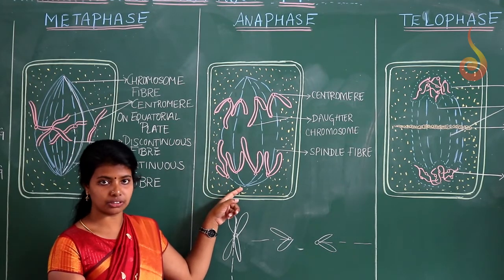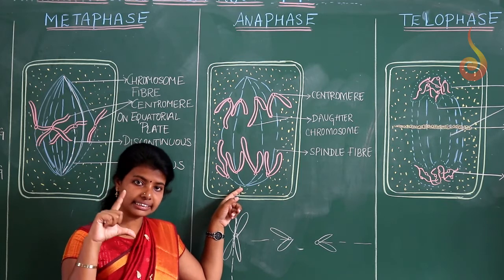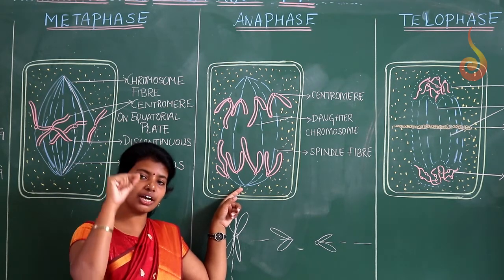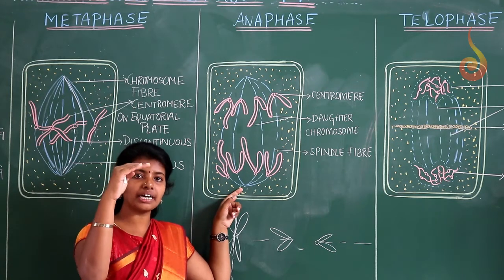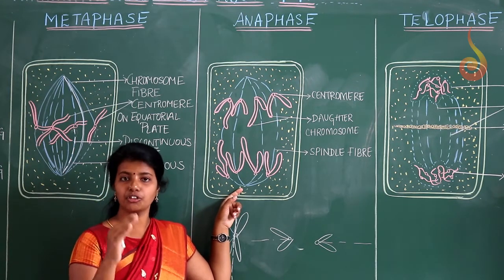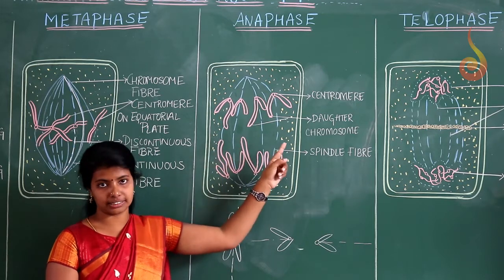and the chromatids have moved to the opposite poles. Now once you see through the microscope, you will be observing an elongated cell which is having dark regions in the opposite poles. The dark regions in the opposite poles are nothing but the separated chromatids in the opposite poles. If you observe any such type of cell, then you will identify it as anaphase.